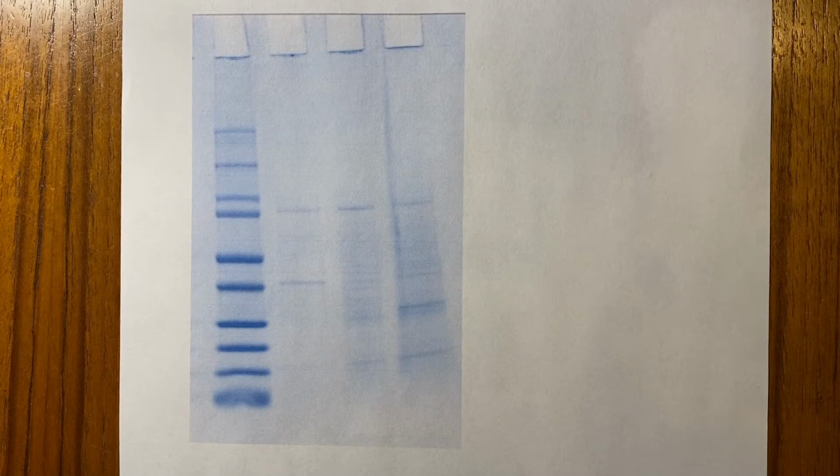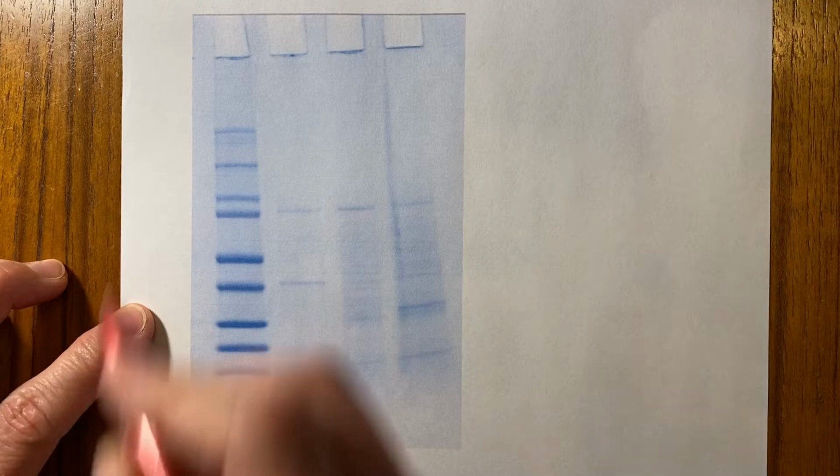What you need to do is make this into a suitable figure for your report, and you also have to do some measuring so that you can get an accurate molecular weight on the protein that you purified from the gel filtration column. So let's label the lanes first.